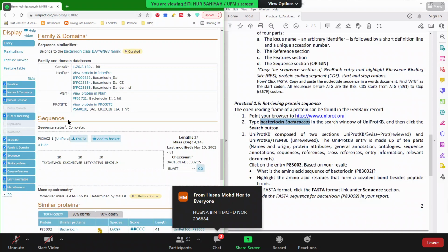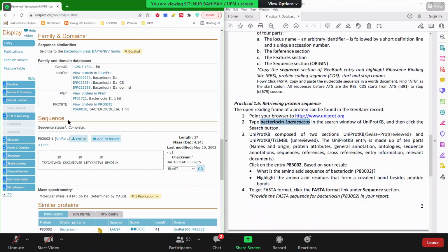Previously I mentioned that you should not come here for nucleotide sequence, but actually they do provide nucleotide sequence. But normally people don't go here just for the nucleotide sequence. They want it solely for the amino acid residue sequence, because you can go to GenBank for the nucleotide sequence. So why be here? Okay, as you guys can see here, that's dash one, right?